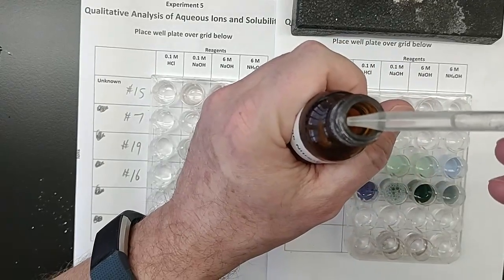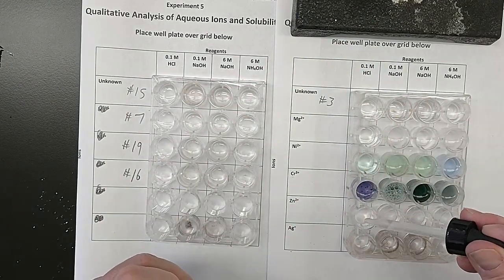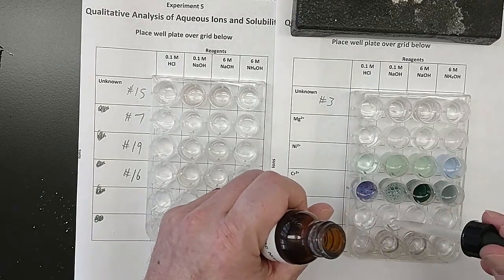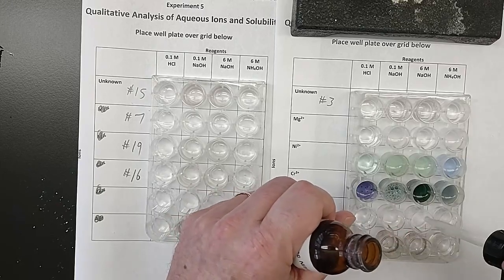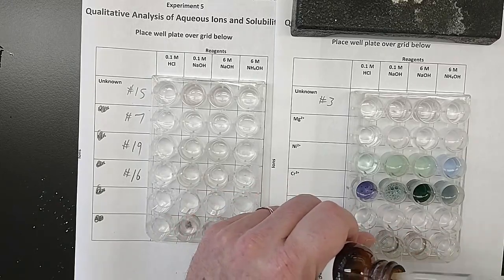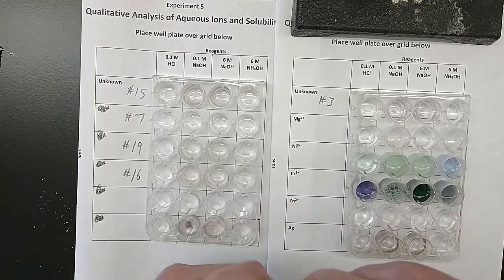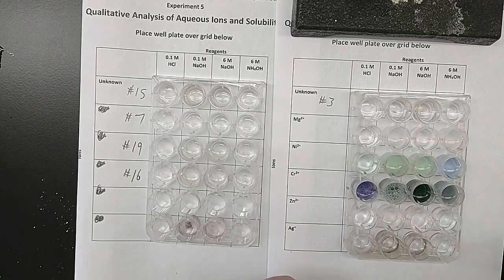Clear and colorless to start with. 10 drops or so in each one. Clear and colorless to start with. I'm recording that on my data sheet.